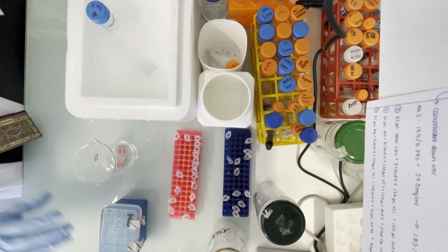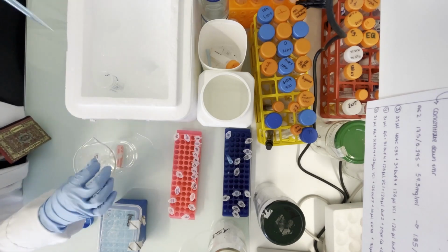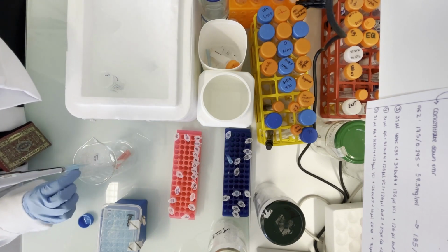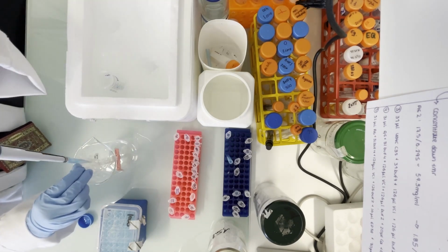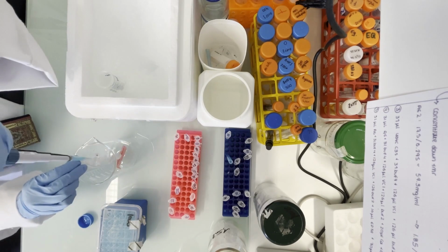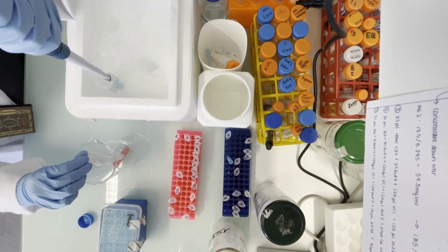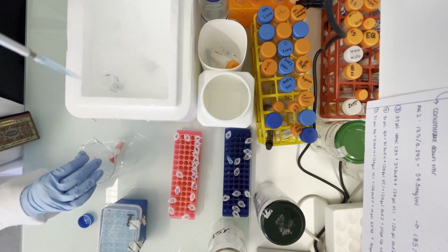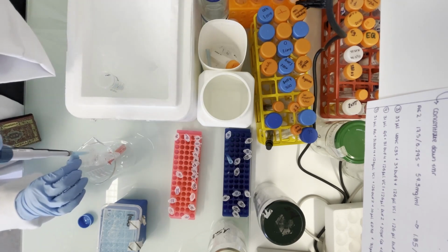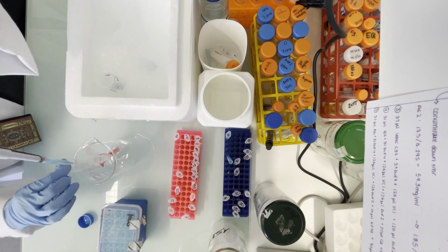For many applications in biochemistry and structural biology, it is convenient to remove the polyhistidine tag on the recombinant protein. This tag is not present in the natural protein, and it may therefore affect its physiological function. To remove it, the original construct design usually incorporates a protease sequence after the polyhistidine tag, so that the tag can then be removed by proteolytic cleavage. In our case, we use a sequence corresponding to the cleavage motif of the tobacco etch virus protease, TEV in short. In practice, to remove the his tag from our purified protein, we incubate the protein overnight with TEV protease.